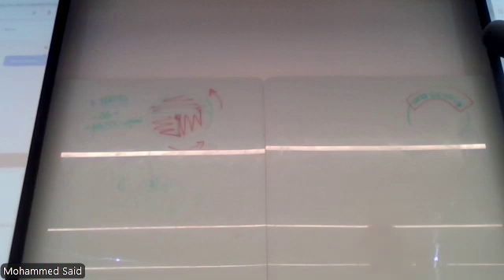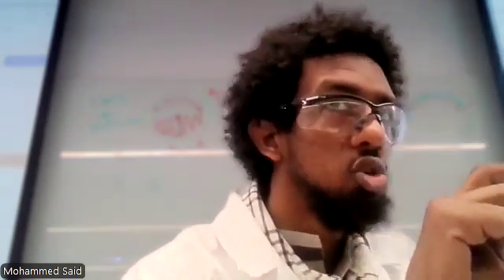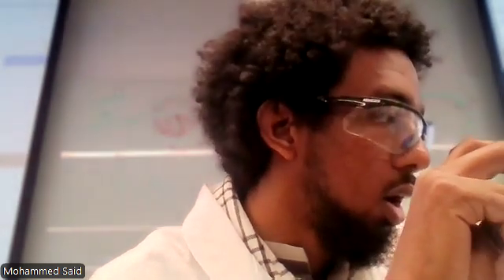Some of you have been asking about exercise 3. Can I just confirm if all of you are done with exercise 2, the plaque assay? Your group almost done or done? Okay. So about 15 minutes, I'm guessing. Your group is almost done. Conjugation, plaque assay. Okay. So you're heating them up. Are they now in the incubator? All of them, with the colonies and plaque?